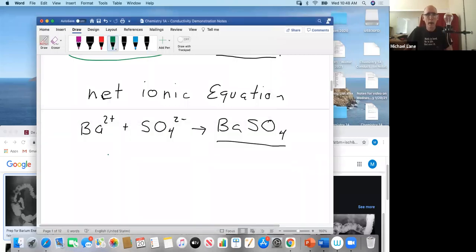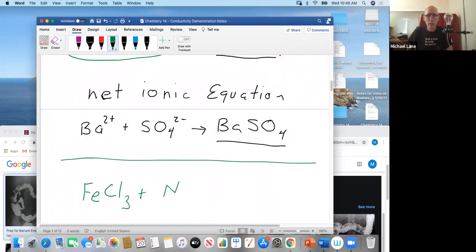Set those right there and share screens for a moment. So in a moment, I am going to demonstrate the reaction of iron chloride and sodium hydroxide.